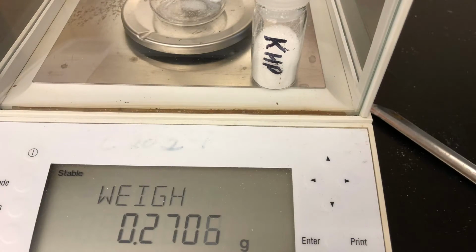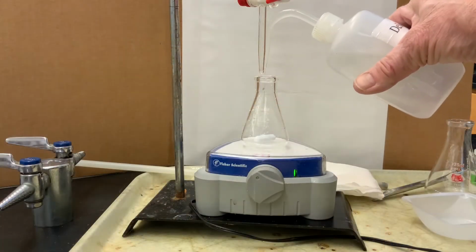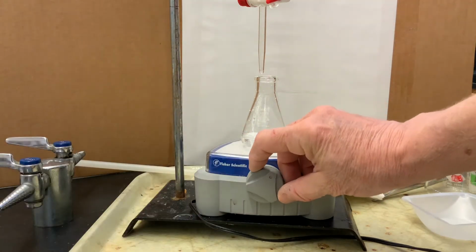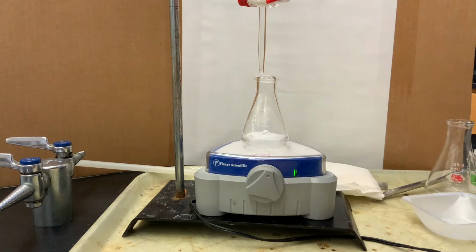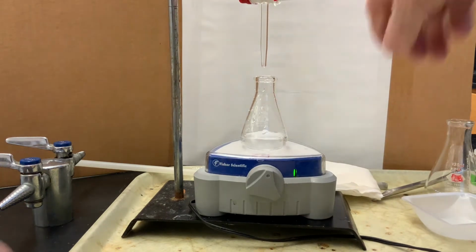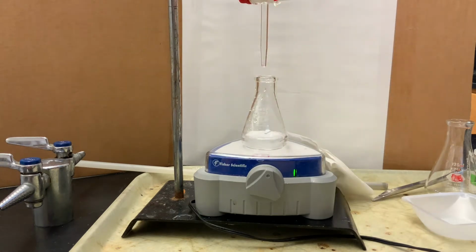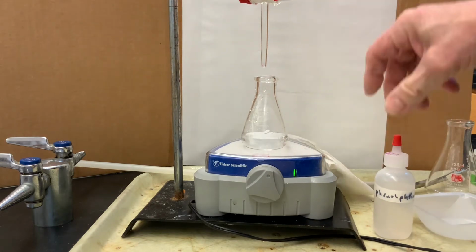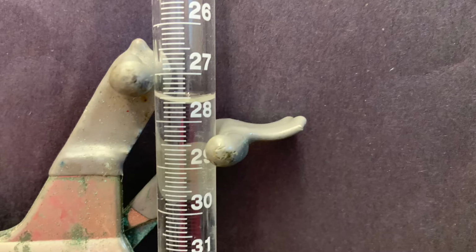First, the KHP. So all of the acids, including the KHP that you see here, will be dissolved in water. And we'll use the stirring plate to do the stirring for us. And we just need enough water to be able to cover the stir bar. The amount of water does not change the moles of KHP or the moles of acid. Don't forget your indicator. We'll use phenolphthalein.